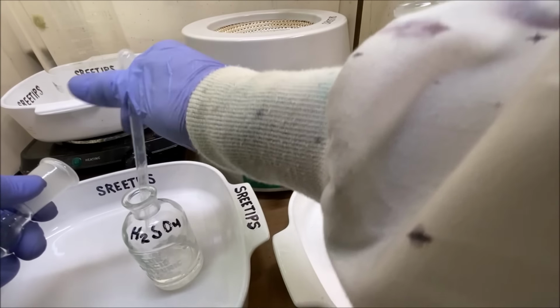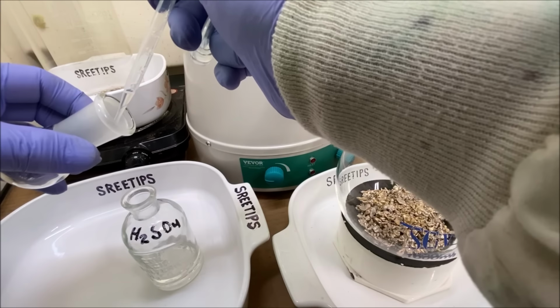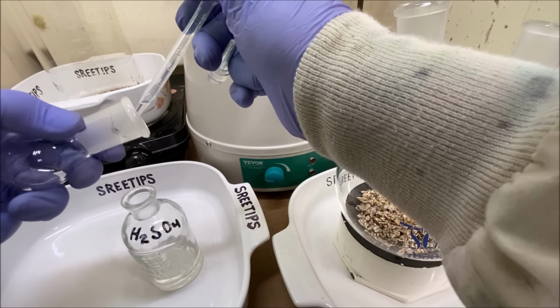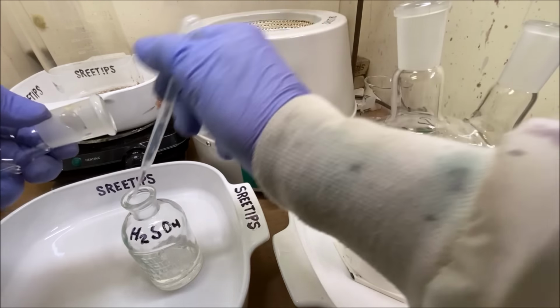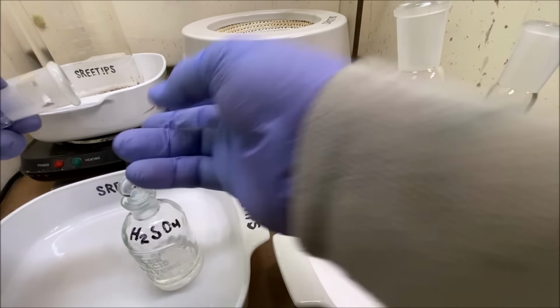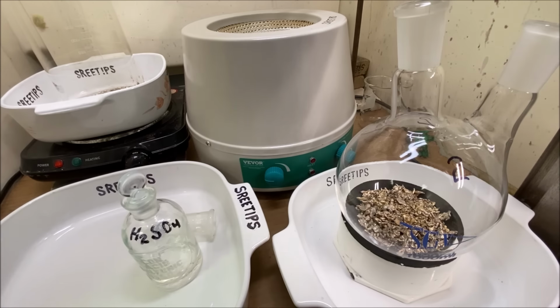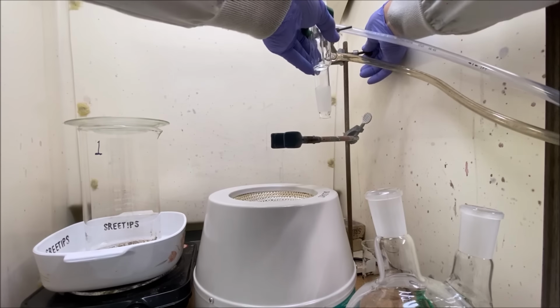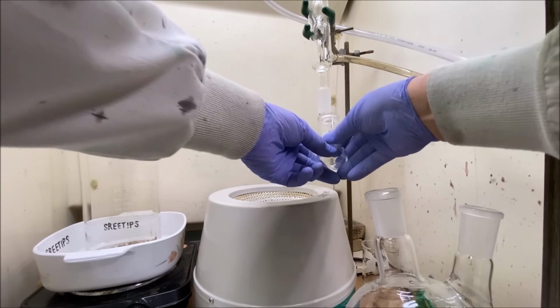What we'll do is add a few drops of sulfuric acid to this thing on the inside. Someone suggested that we do this to lubricate the glass joints so that we don't have a problem with them sticking together. So now we'll swing this out, swing our condenser out up here, get this sulfuric acid on this joint.